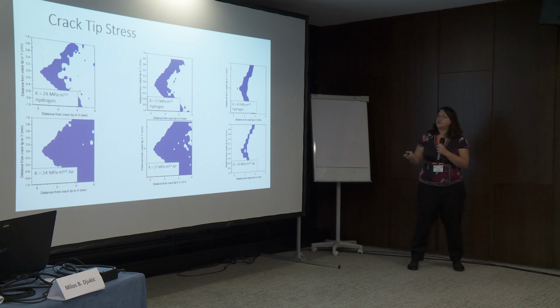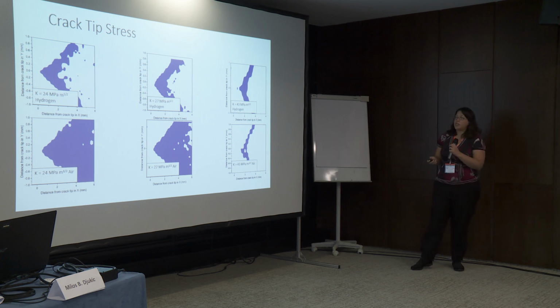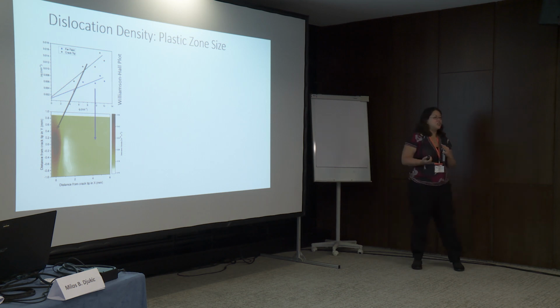So clearly whatever hydrogen's doing here is somewhat similar to what's happening when you have lots and lots of plasticity towards the end of the crack. So let's look at what's happening with the plasticity. Let's look at the plastic zone size.